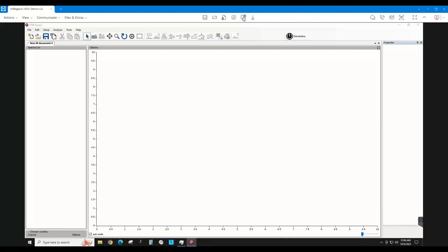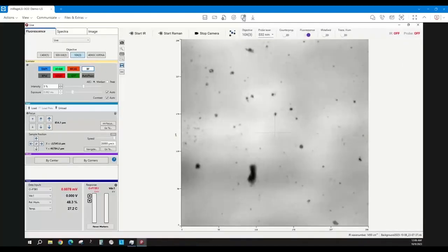real sample measurements. On what is normally our left-hand screen, what you see here, is where all of our data is captured and stored, and where you'd be manipulating and exploring your data. On the right-hand side screen is our live view. This is where you're setting parameters and so on. I'm going to switch off the fluorescence for a second.